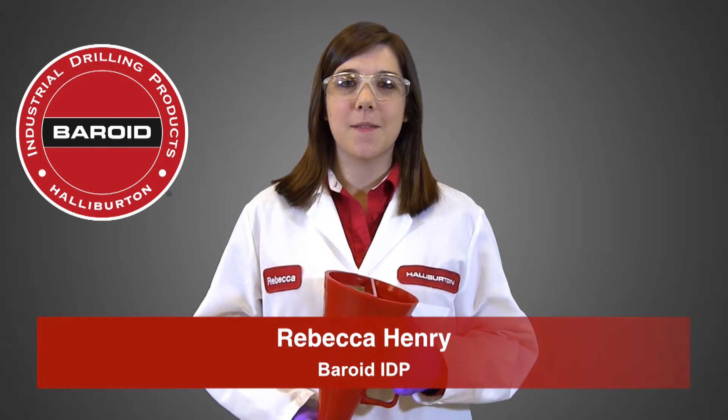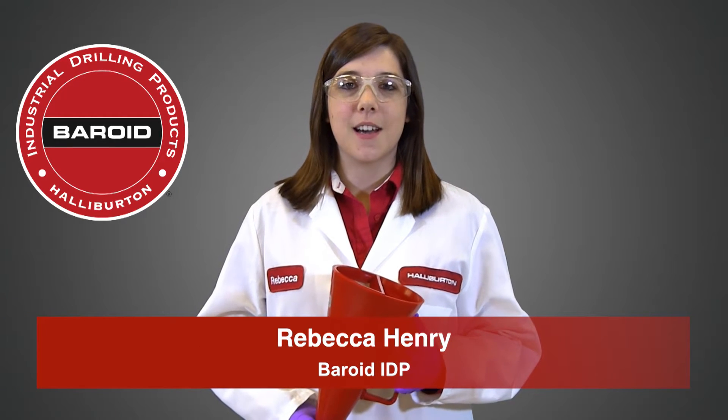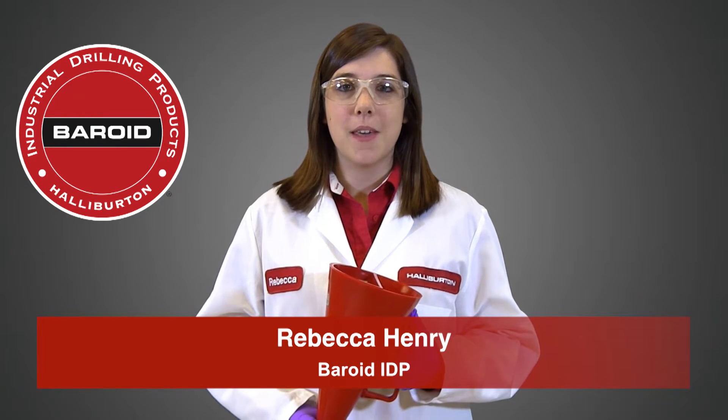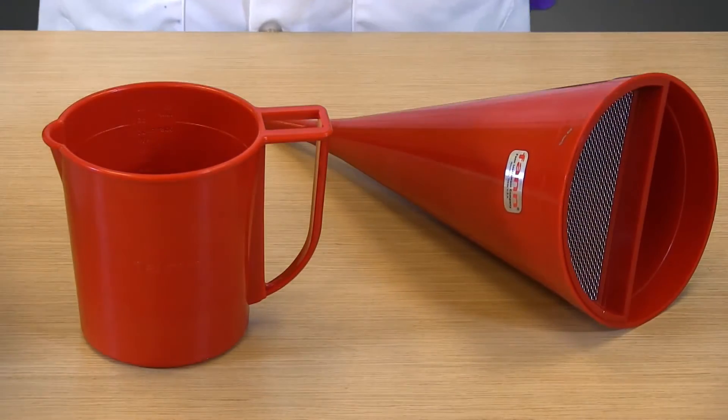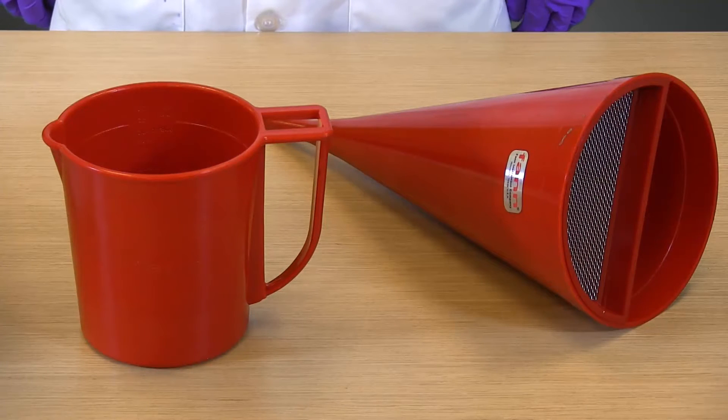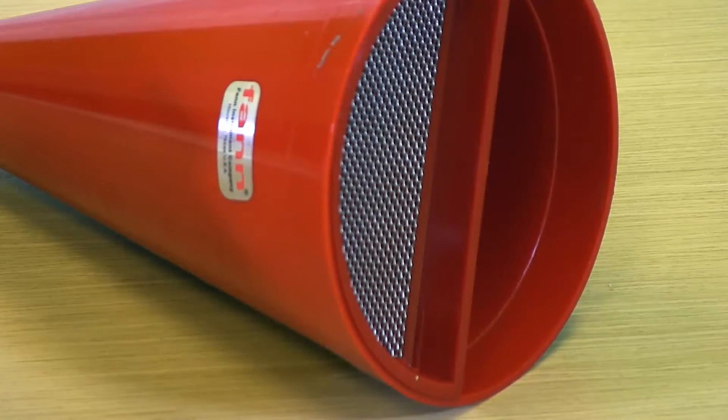When it comes to measuring the viscosity of a drilling fluid, the Marsh Funnel Viscosity Test is the one most people think of first, and probably the simplest to do. For this test, we use a Marsh Funnel, which is a 1500 mL funnel that has a screen near the top to filter the mud so no large or unyielded pieces are in the sample that we want to test.